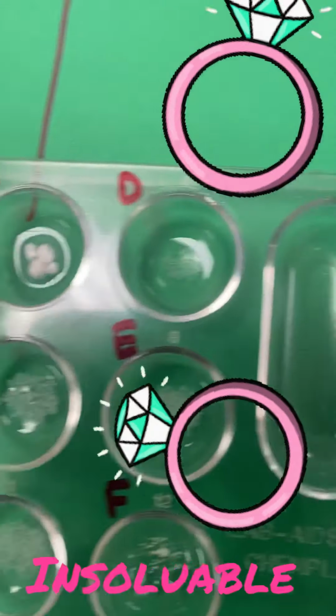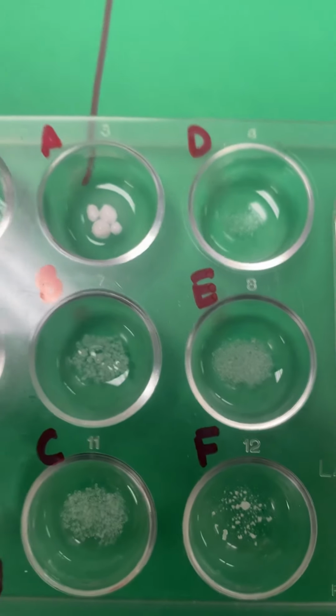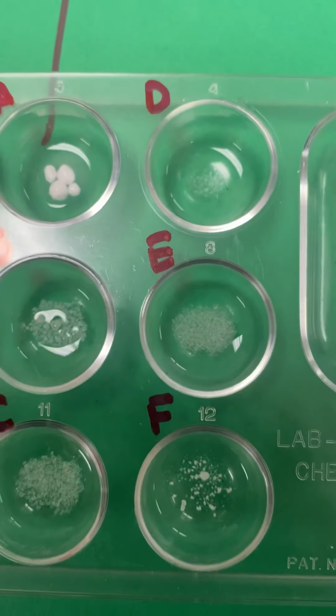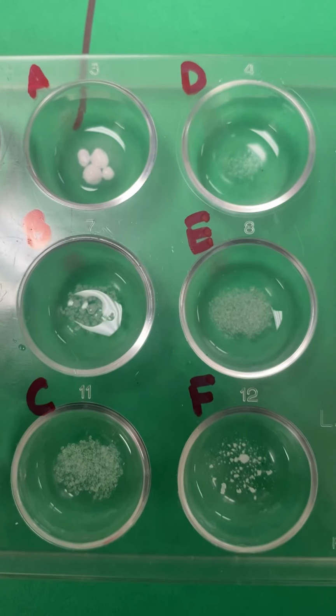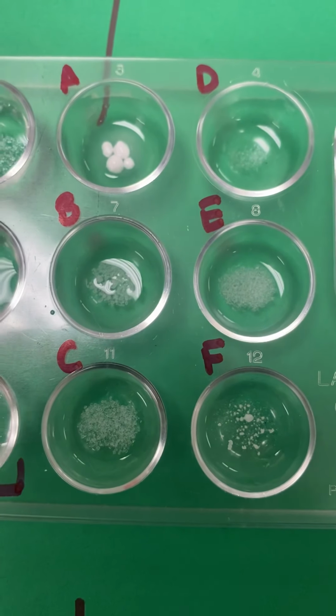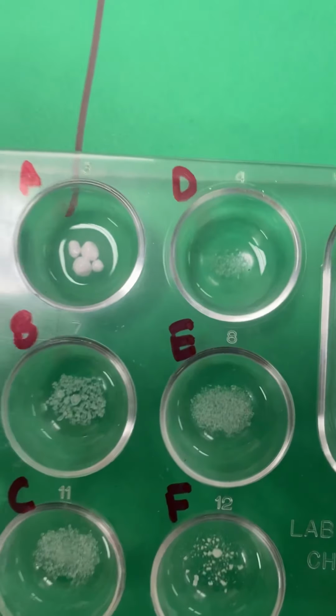Okay, and then we're going to go over to ethanol and see if there's any difference. So A for this one. No. It looks like it's just sitting in there now. B is still there, not dissolved. Clearly still there. C looks like it's clearly still there. D. That looks like it dissolved to me.